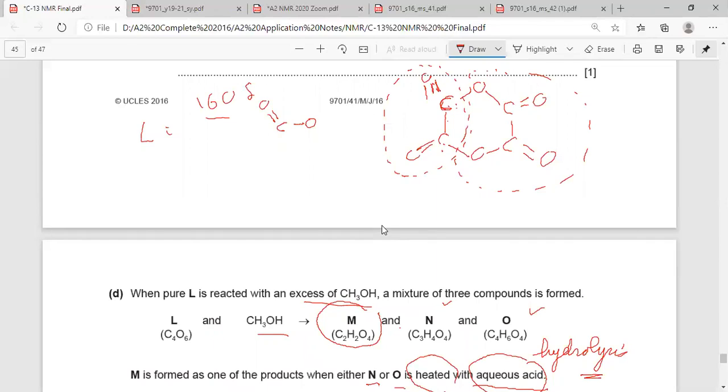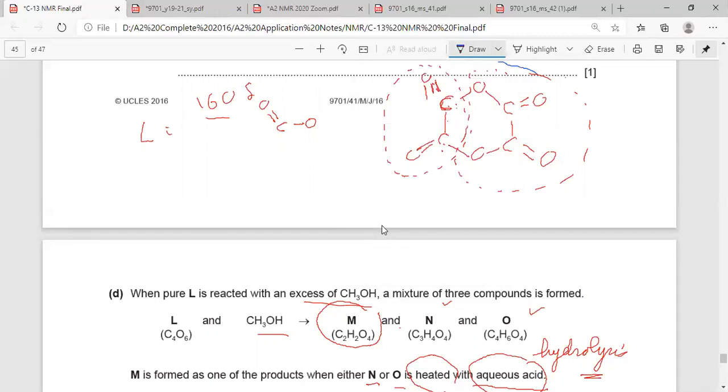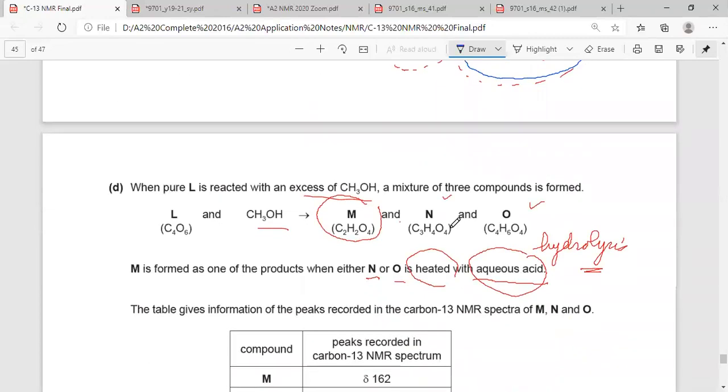That means this part here. I'm going to use blue. So you try to figure out this part here. It cannot be running anywhere. That means the H here, this means the M here. The M has to come from the products of this one here. So M, like this one, should be C double bond O and H. A good example with this one here.